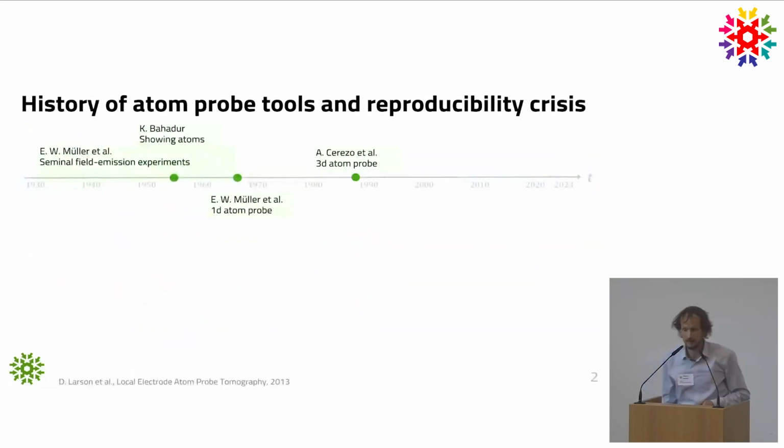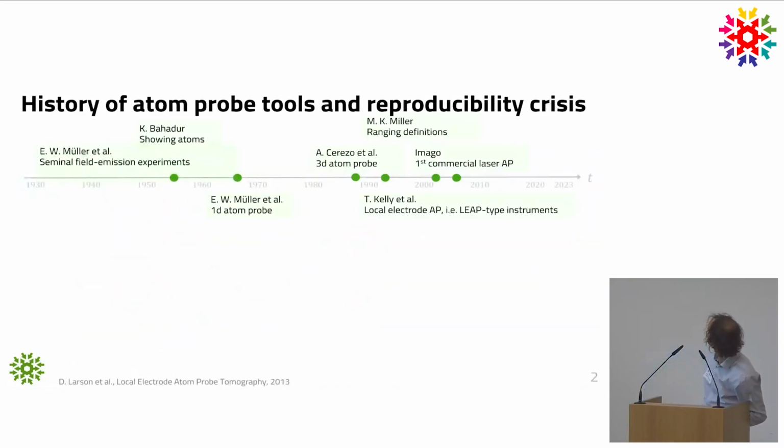Let's go along a time axis a little to put atom probe in perspective. I jump over a very, very long history, because it's important in this very small community. It's in fact 200 to 300 people worldwide who do this technique. It's key to understand that in this hyper-competitive field of research data management, with every new research data management system popping up like a mushroom farm, the process of getting there in atom probe tomography proceeds at a much slower speed.